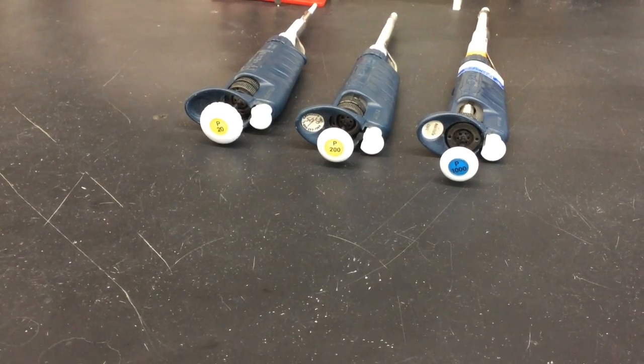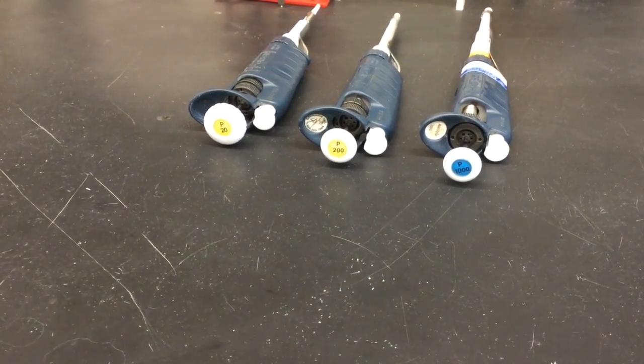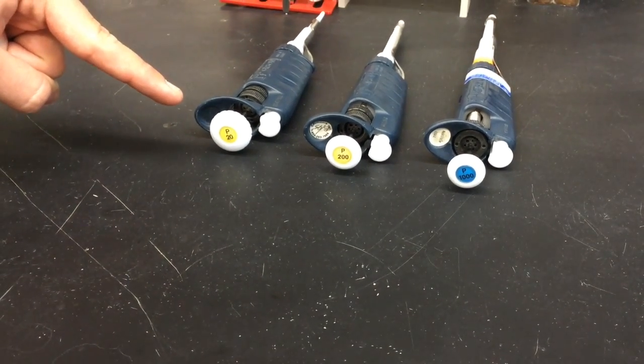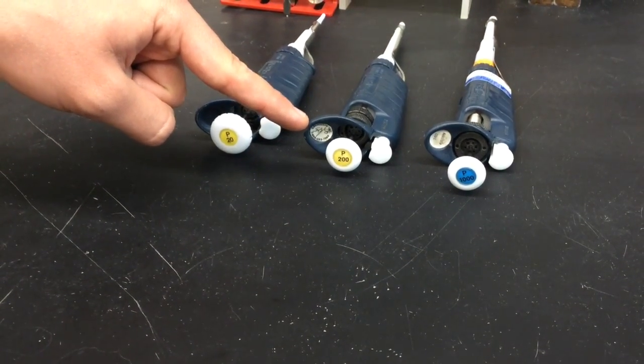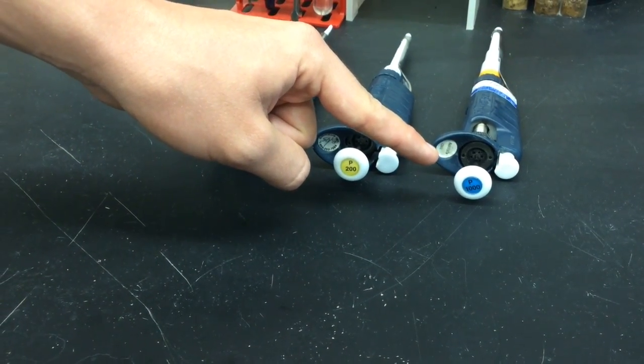These instruments come in several sizes which are capable of pipetting different ranges of volumes. The most common are the P20 which can deliver 2 to 20 microliters, the P200 which can deliver 20 to 200 microliters, and finally the P1000 which can deliver 200 to 1000 microliters.